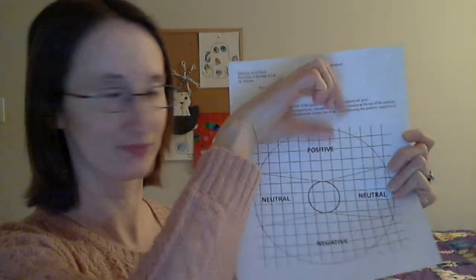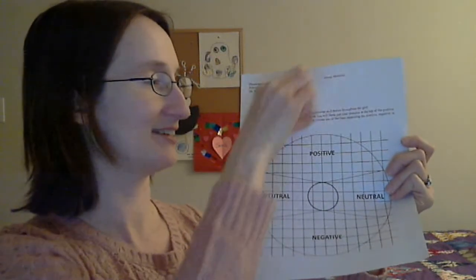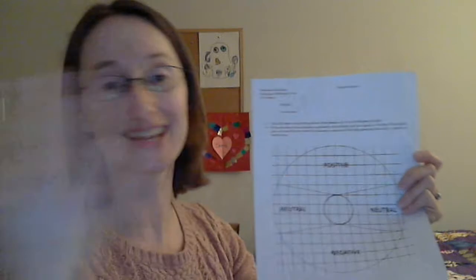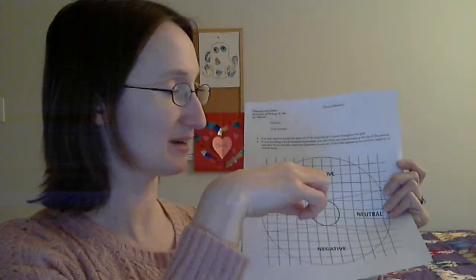So overall, let's say you have your grid sheet, put your worm in the middle, you put a light source up here at the very top, and you're saying, okay, I shined a happy yellow light, yellow smiley faces, maybe you think the worms are going to like yellow light. And so you're going to do the experiment, you're going to put the worm here on your data sheet, you're going to record where the worm goes, and then you're going to calculate the % of time that the worm spent in that positive area.